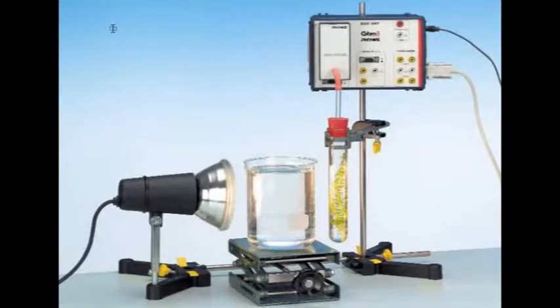Take a look at this apparatus. It has been designed to measure the rate of photosynthesis in relation to light intensity. We are able to carefully manage all of the other factors so that the only thing we will change is light intensity. The rate of photosynthesis is calculated by looking at how quickly oxygen bubbles are generated.